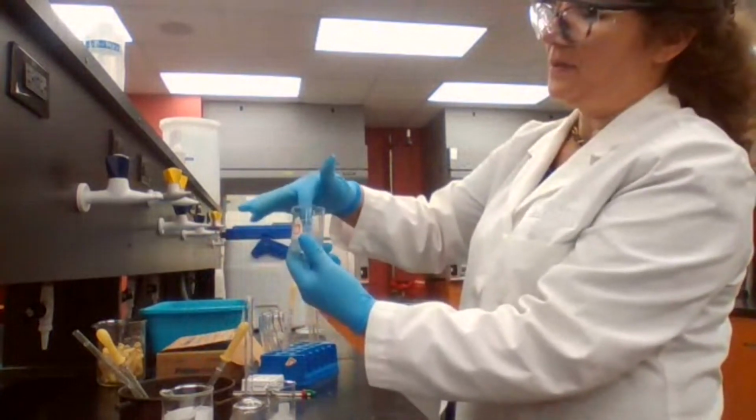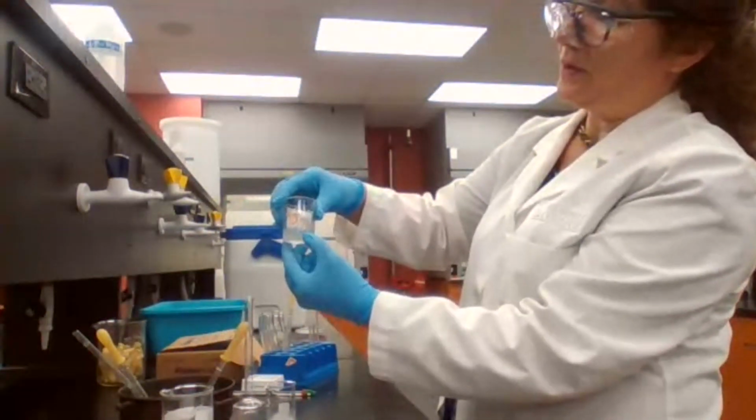So I fill up the beaker up to the mark with ice, and get this water out. Now I pour the sample over the ice. Okay, while I'm waiting for these crystals to complete, I'm going to just place it in ice for extra.